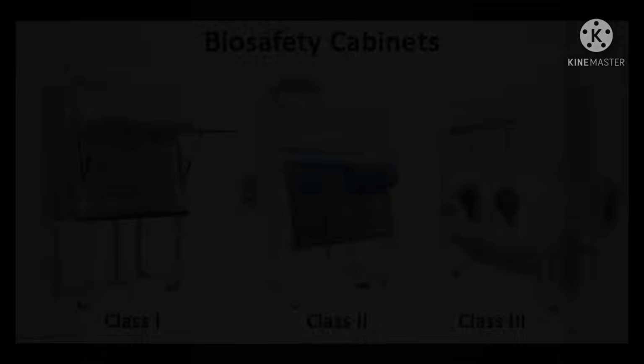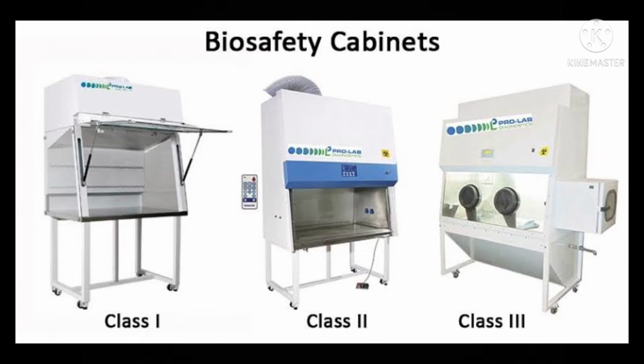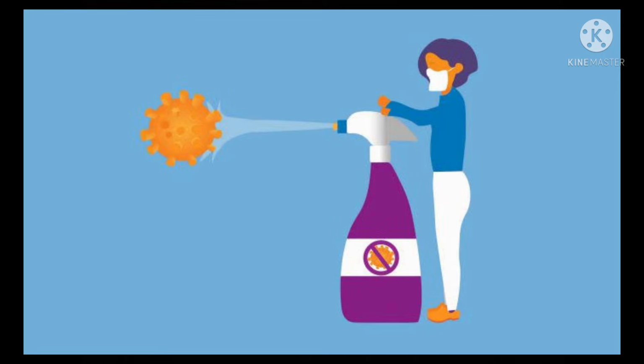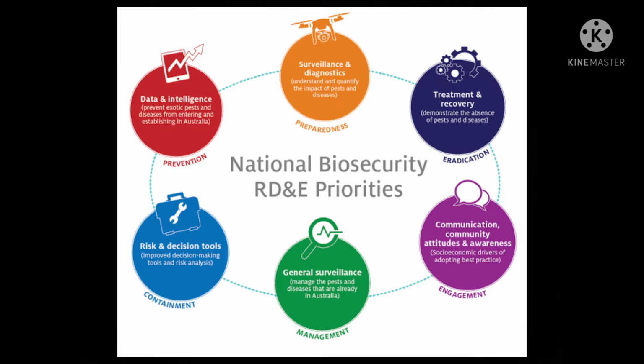There are also different types of biological safety cabinets that we will be discussing later on, the good microbiological techniques, and how to disinfect and sterilize equipment. In terms of biosecurity, it covers the packaging required by international transport regulations and other types of safety procedures for chemical, electrical, ionizing radiation, and fire hazards. The manual puts emphasis on the continuous monitoring and improvement directed by a biosafety officer and a biosafety committee.